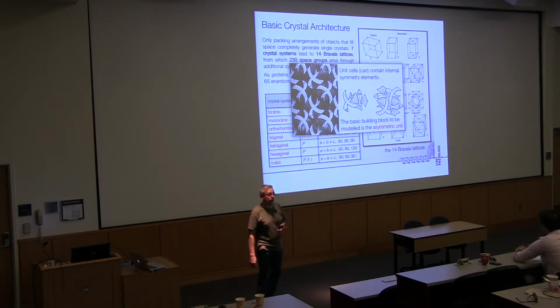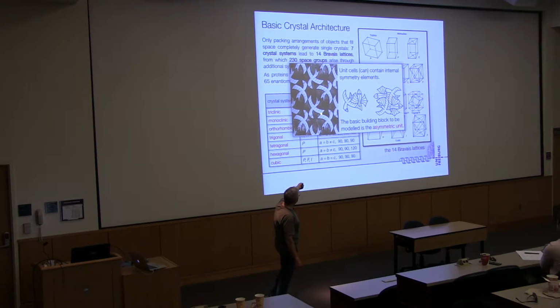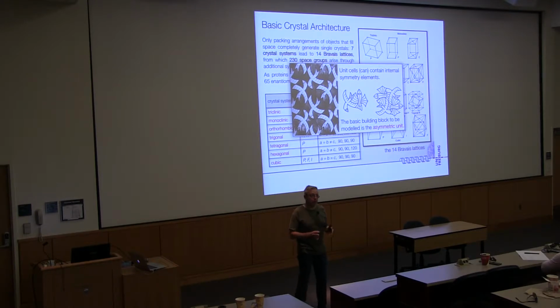So what's actually happening here? Well, that is symmetry. There is a twofold symmetry axis right here. And this picture is only up here, and down here is rotated around this symmetry axis. So there is an internal symmetry, and the actual unit cell of this crystal would consist of two birds and two fishes with the twofold symmetry axis in the middle. And still, your model that you're interested in is only the bird and the fish. So that's the difference between a unit cell that builds your crystal and the asymmetric unit, which is your task as a modeler to interpret. Okay, so that's what we're after.